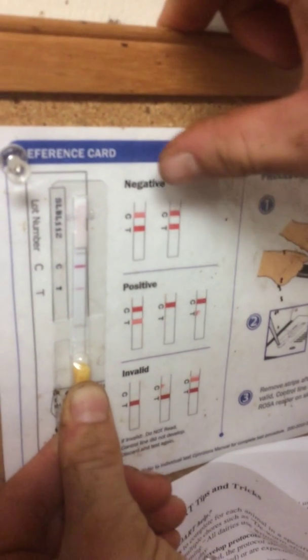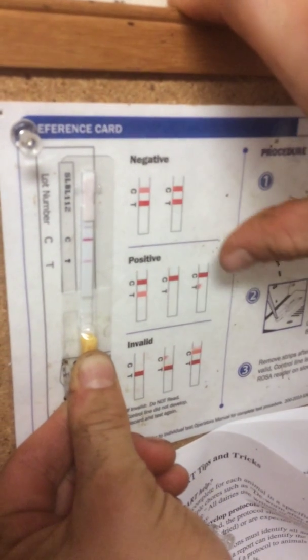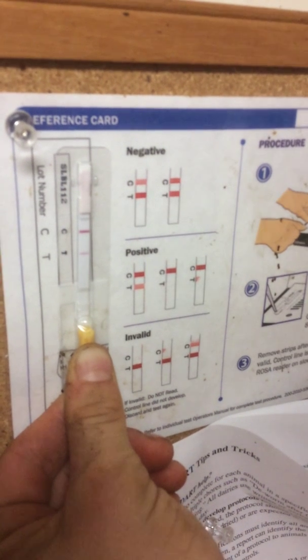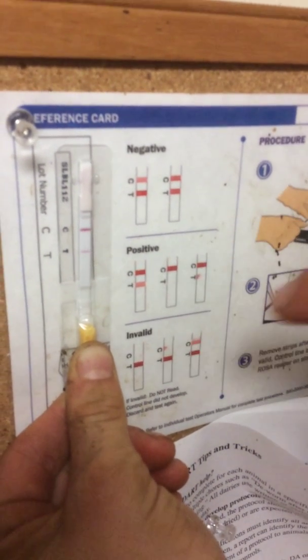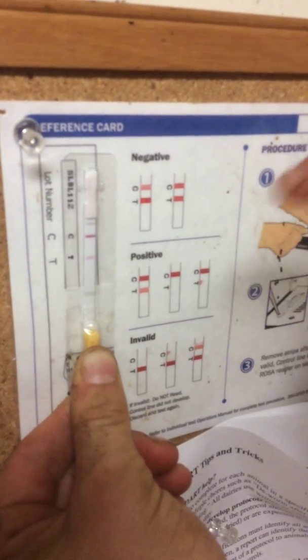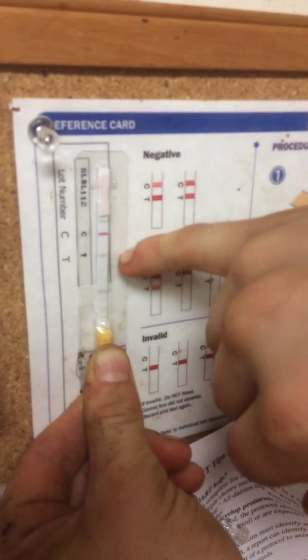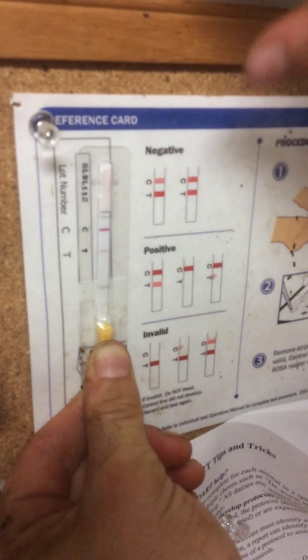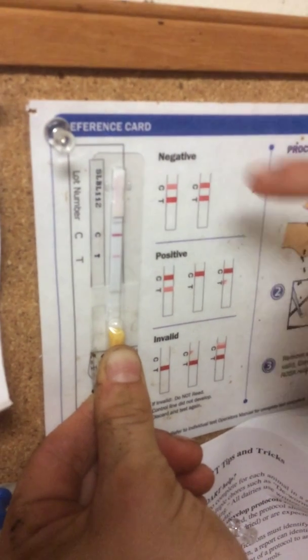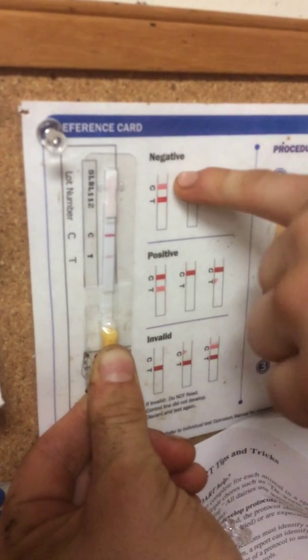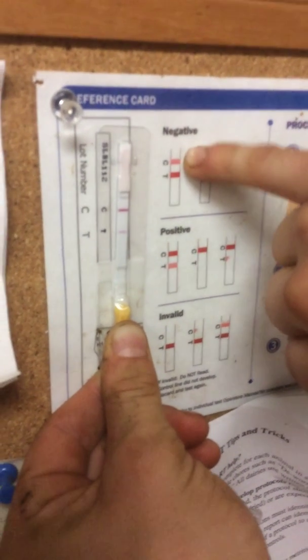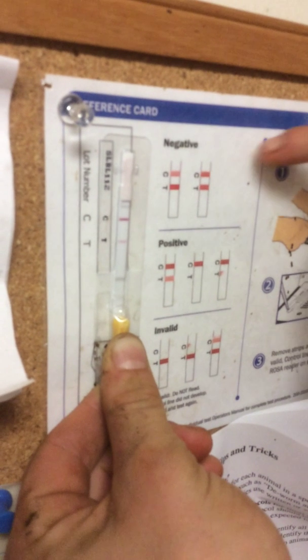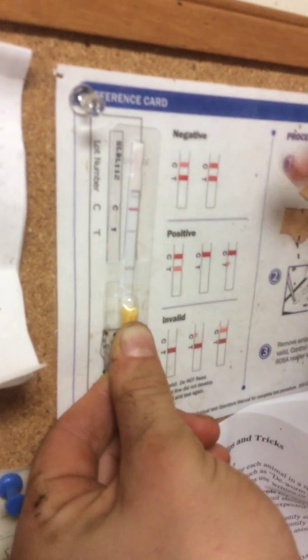Now we're looking at whether it's negative, positive, or invalid, and to do that we're looking at how dark these two lines are. For negative, the top line is lighter than the bottom line, or they're the same.